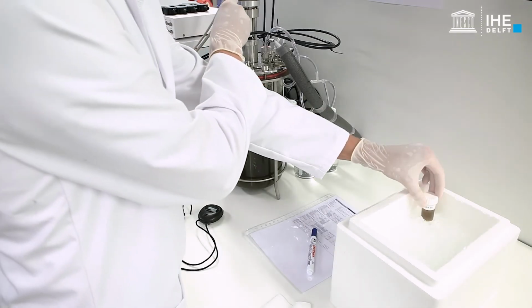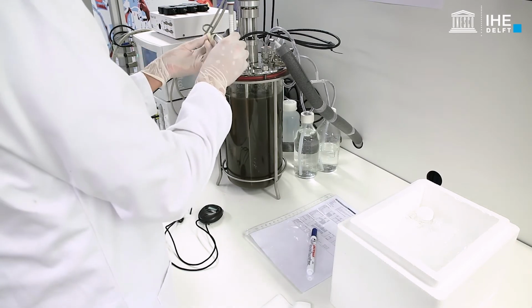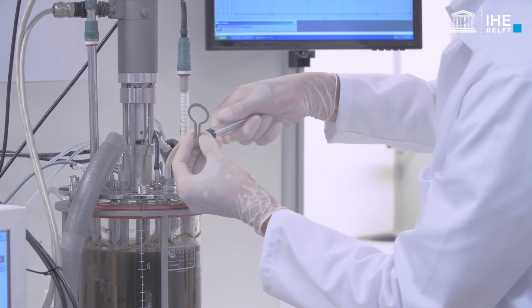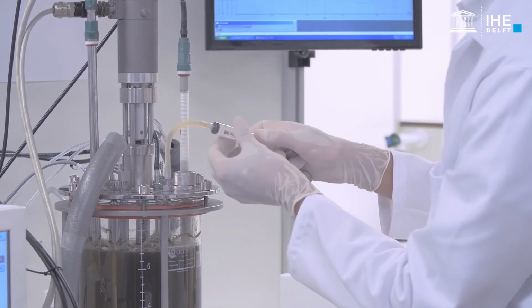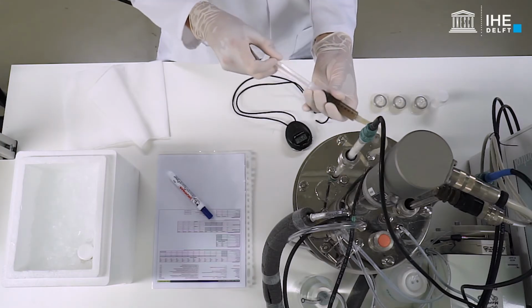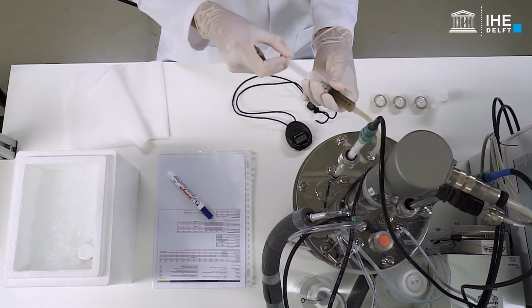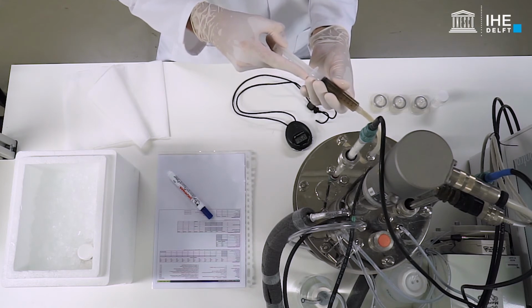To preserve the samples, place the samples in ice. If possible, the samples have to be collected in triplicate. For the determination of the soluble compounds of interest, filter the samples through 0.45 pore size filters.